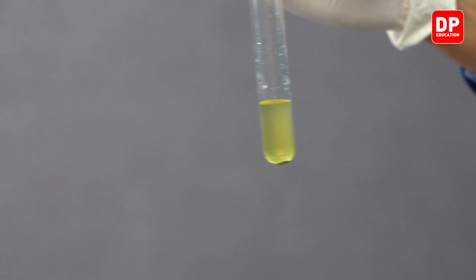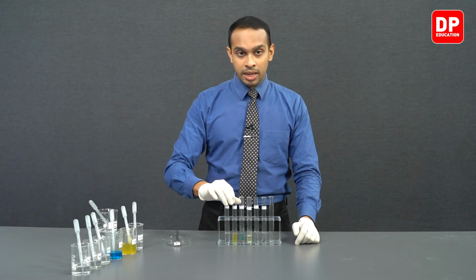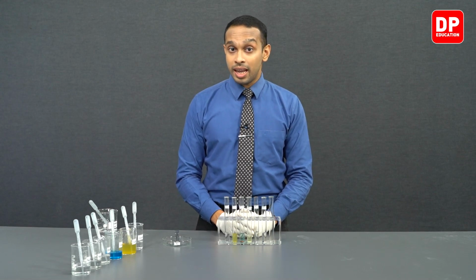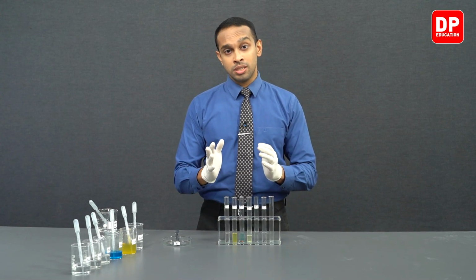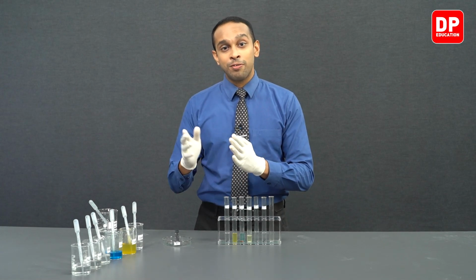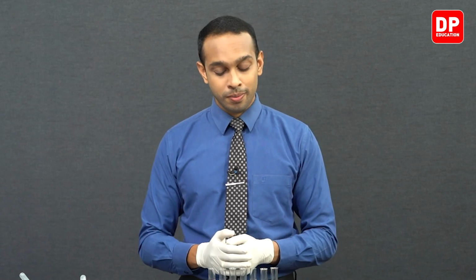So this indicates Fe2 plus and the metal have not shown any reaction. Of course, students, iron metal solid cannot displace Fe2 plus ions, right? It's a part of the same equilibrium, so it cannot displace Fe2 plus ions. So because of that, we don't see a reaction here.